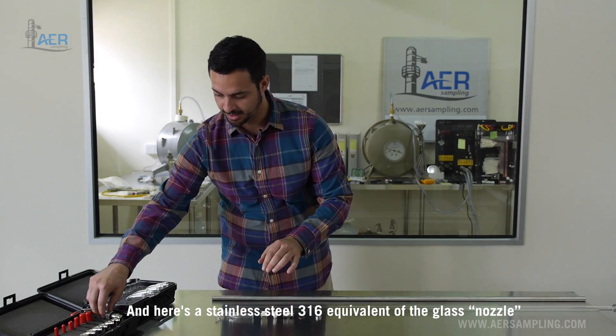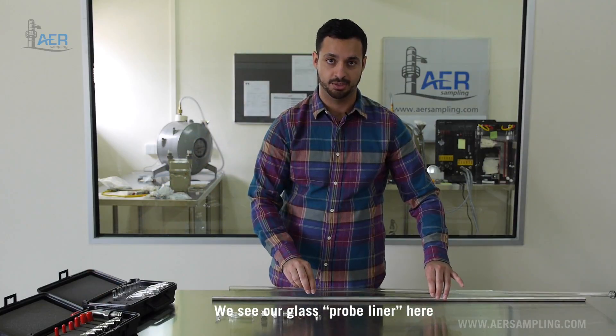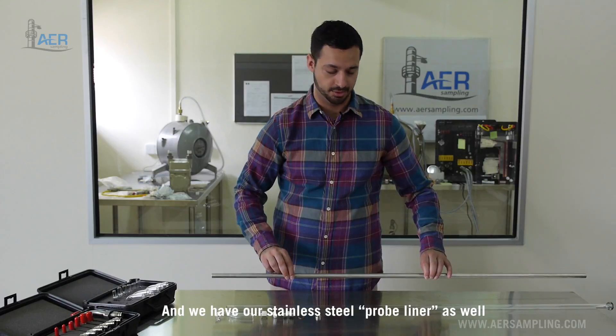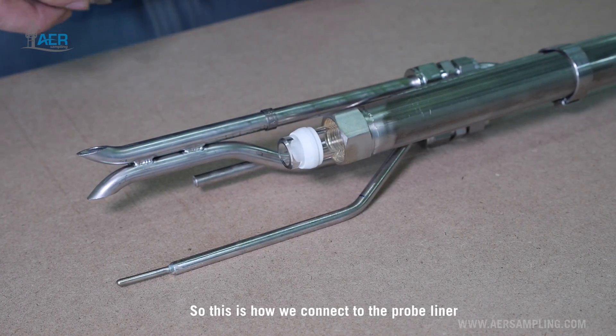Here is a stainless steel 316 equivalent of the glass nozzle. We see our glass probe liner here and we have our stainless steel probe liner as well. So we have our nut, our Teflon ferrule, our union, our o-ring, and the backer ring. This is how we'll connect to the probe liner.